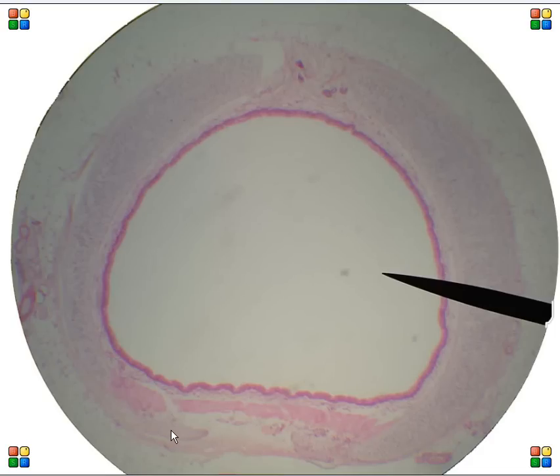This is a rat trachea. And you can see the cartilage that is keeping this airspace of the trachea wide open. The cartilage appears in a C-ring shape almost all the way around. And at the back, we have this area of muscle tissue, which is called the trachealis muscle. So in this image, we've got hyaline cartilage. We've got the trachealis muscle at the back.